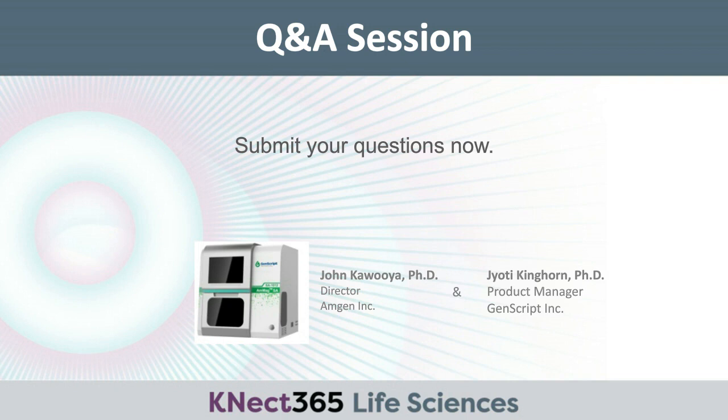Hi, so this is a question for GenScript again. So, no, you don't have to incubate the beads for 18 to 24 hours. That is only for your convenience if you wanted to set up the binding step the night before, so you did not have to do that in the morning. However, the recovery is not affected, and you would get the same recovery in a few hours of binding.